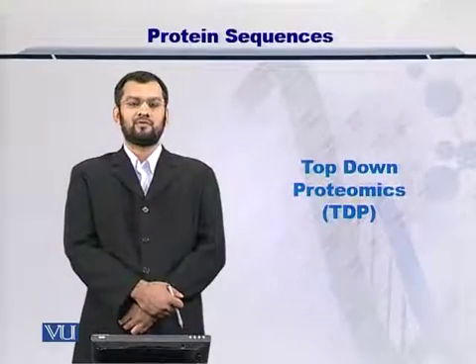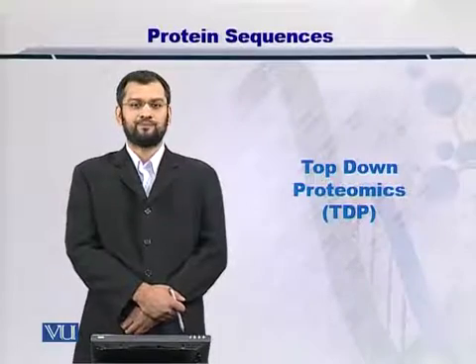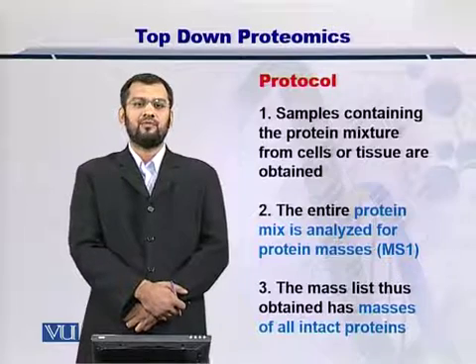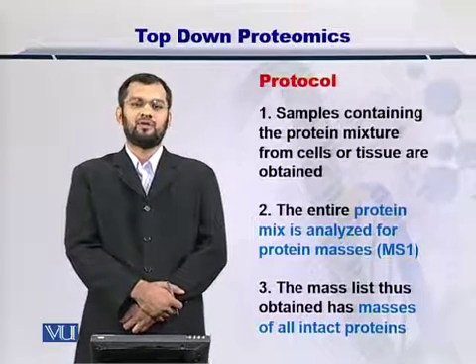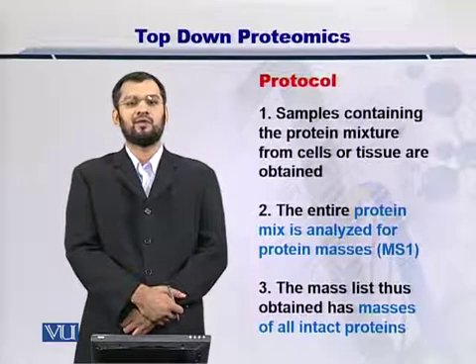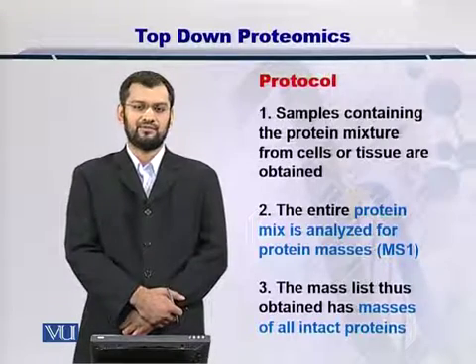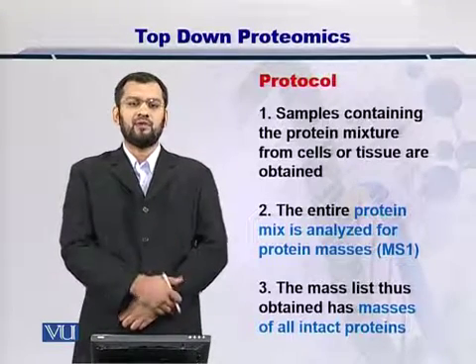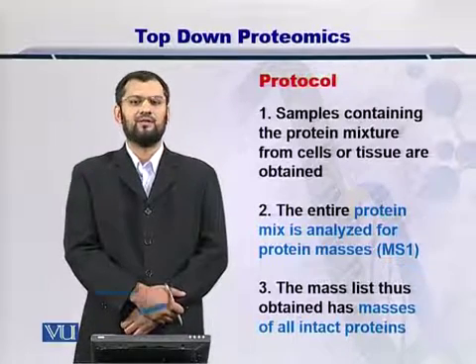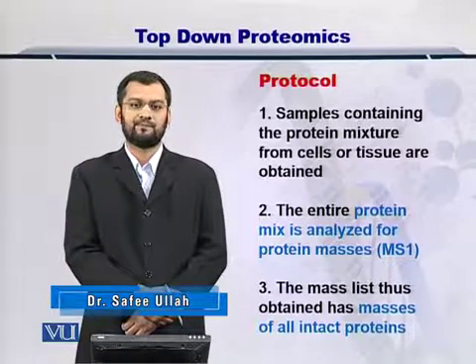Dear students, in this module, we're going to talk about the top-down proteomics protocol. As you know, with bottom-up proteomics, you have to digest proteins into their peptides, and then you have to search those peptide masses with the in silico digested peptide masses from the protein sequence databases. It is obvious that you cannot measure the entire protein molecular weight. This is a major shortcoming in bottom-up proteomics.